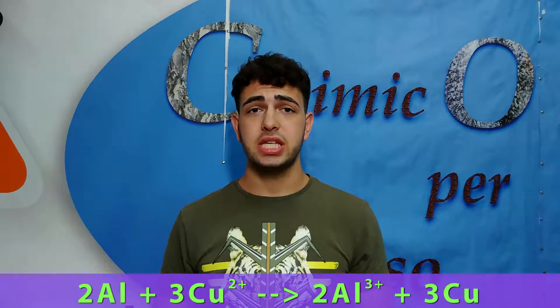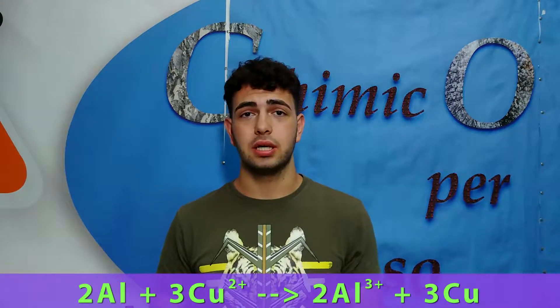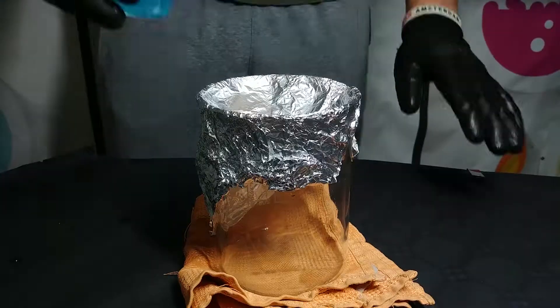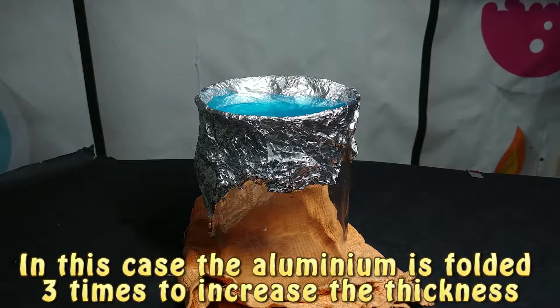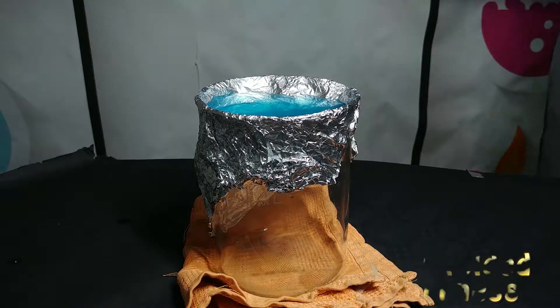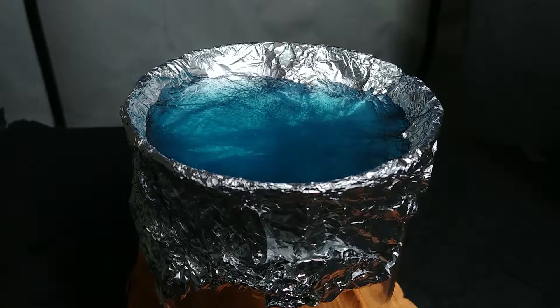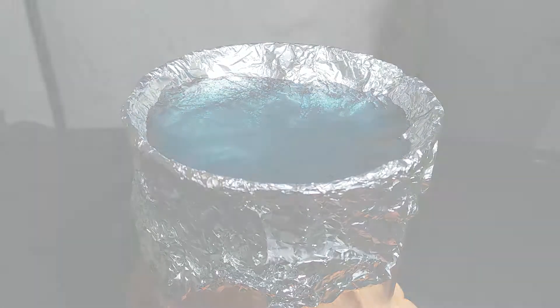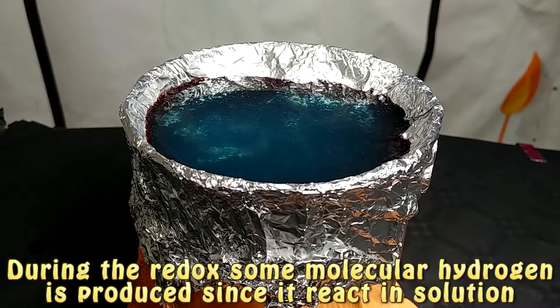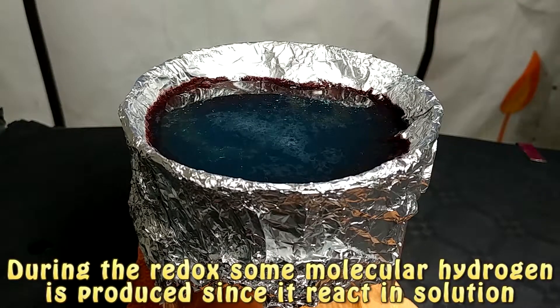The reaction happening in this solution produces copper, because copper is a more noble metal than aluminium and is displaced from the solution. You can also see that hydrogen is produced, which causes the particular form of copper that you observe in this experiment. As the reaction proceeds, the aluminium foil becomes much thinner, and that's why at one point it breaks down and the solution falls.